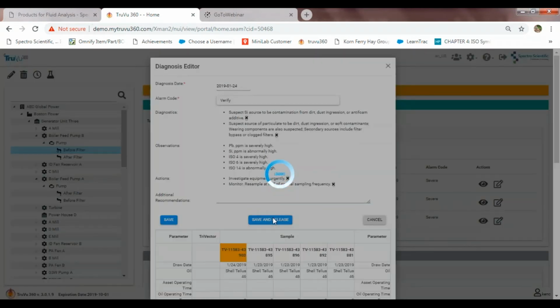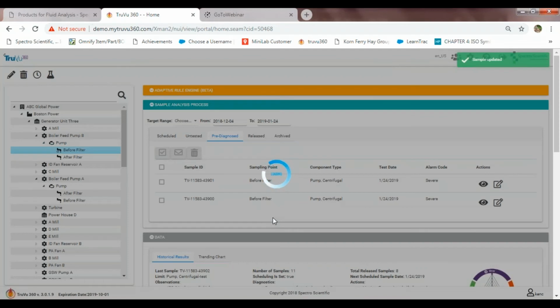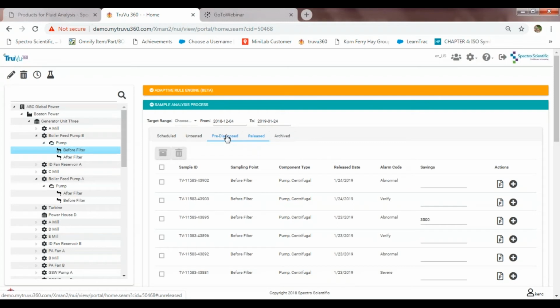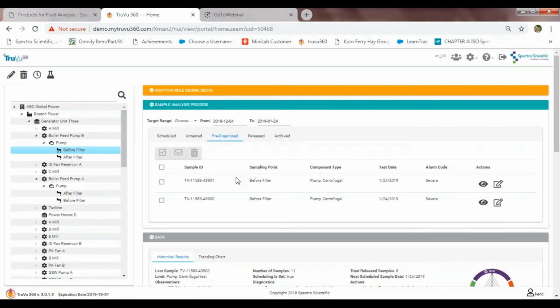All right, so I have a few reports released. Now, when I say reports are released, there's 2 functionalities. I automatically release those from the other categories. You can see now that I have a variety of released reports, not just today, but previous days as well. But you can also say, all right, I have a report, they're all looking good, so I'm either going to release it and notify or just release it.